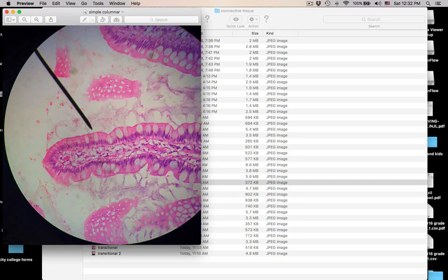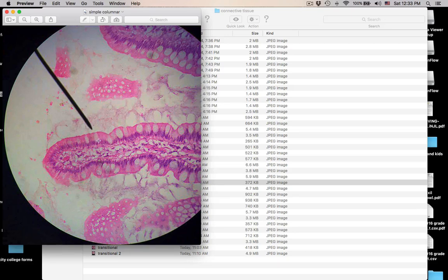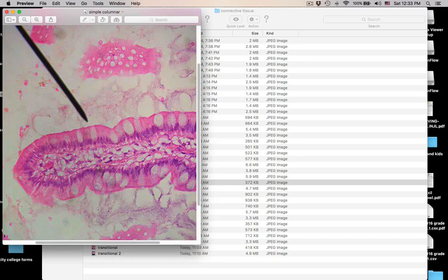Pointer in the lumen. Here's the basement membrane somewhere down here — this is connective tissue below. It looks one layer thick, so it's simple. The nuclei are elongated, so it's columnar. You can see a hazy border up here — that's microvilli. And these white blobs are goblet cells releasing mucus. This is simple columnar with microvilli and goblet cells. Microvilli are cytoplasmic extensions that increase surface area for absorption.